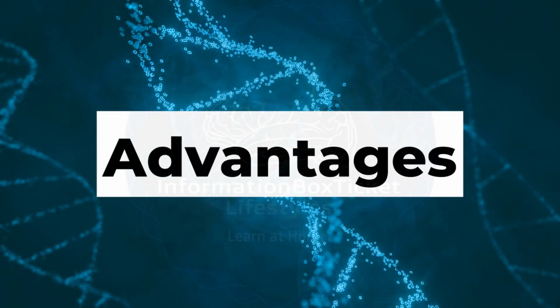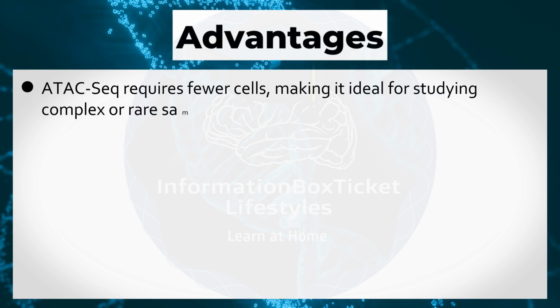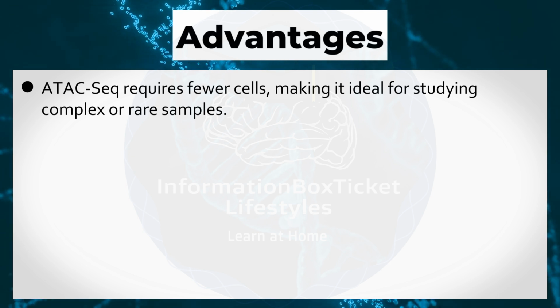Advantages of ATAC-Seq. ATAC-Seq requires fewer cells, making it ideal for studying complex or rare samples.